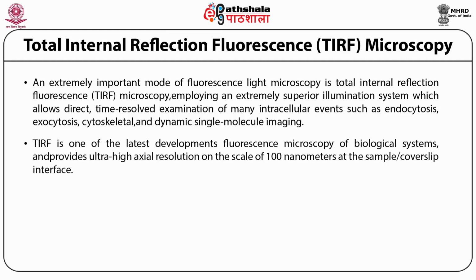TIRF is one of the latest developments in fluorescence microscopy of biological systems, and it provides ultra-high axial resolution on the scale of 100 nanometers at the sample or cover slip interface.